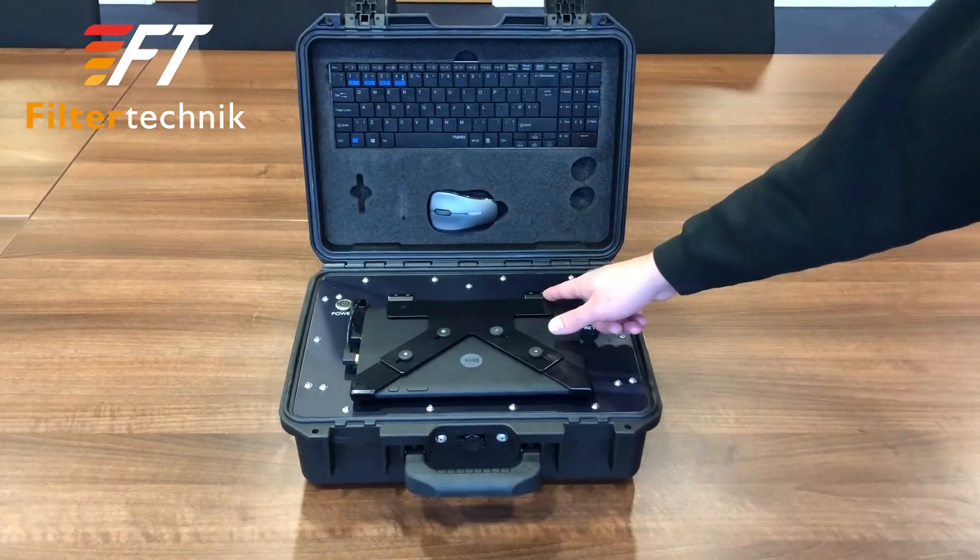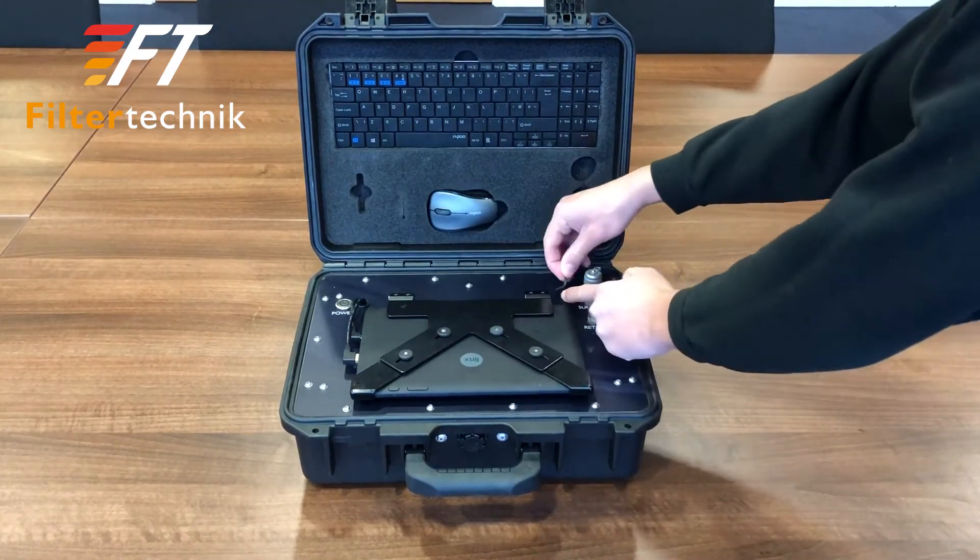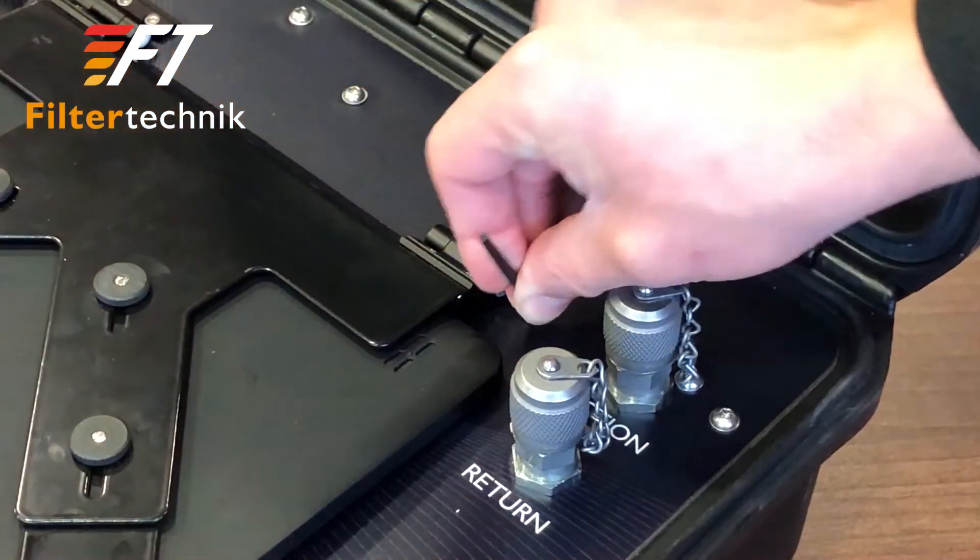Here we have the hinges on the back of the tablet. The allen key is used to adjust the tablet's hinges for whatever reason this loosens.